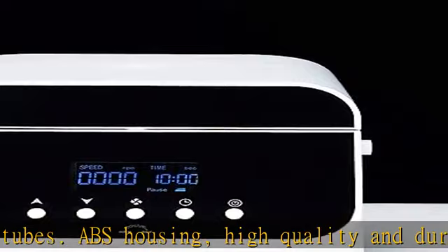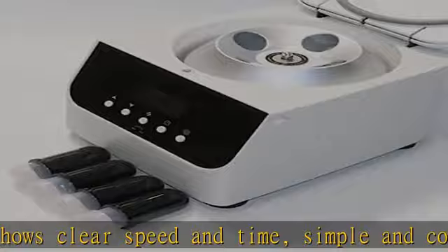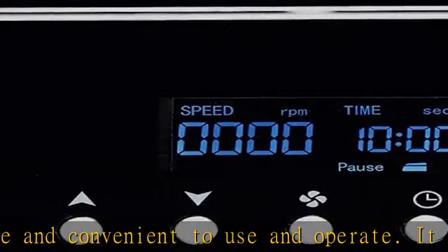It will automatically stop when opening the lid. Stabilized feet on the bottom of the low-speed benchtop centrifuge can prevent the machine from shaking during operation. It runs smoothly with low vibration and low noise. It's widely used in fields such as medical research.